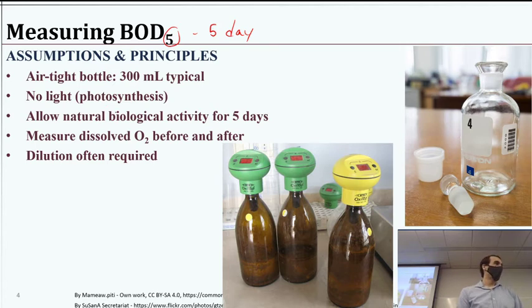Then we're just going to allow whatever bacteria, whatever biological processes are happening, to do that for 5 days. And we're going to measure the oxygen before and after, and maybe even during. So these guys have oxygen sensors inside here. These lids are also going to keep the solution airtight, so that we don't have exchange between the air and water inside here and the atmosphere. We don't want that.